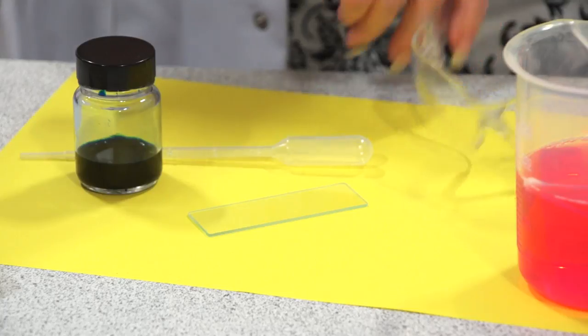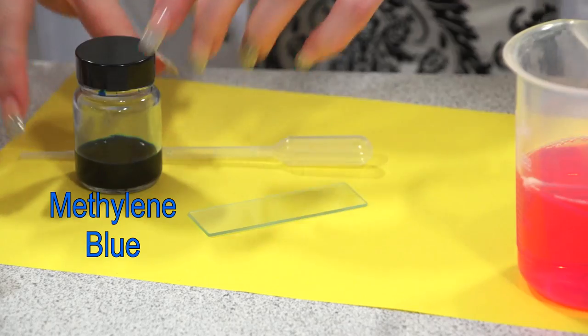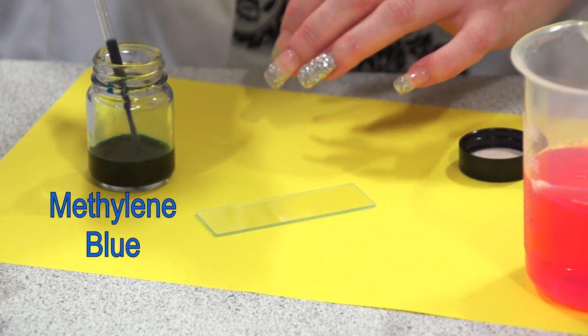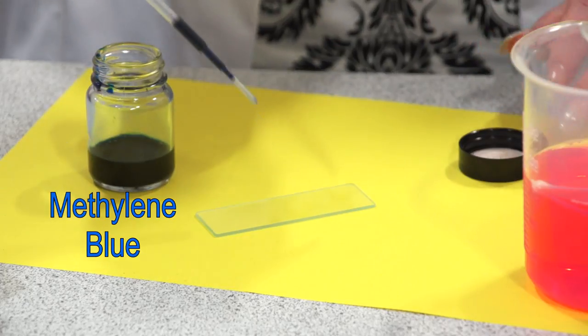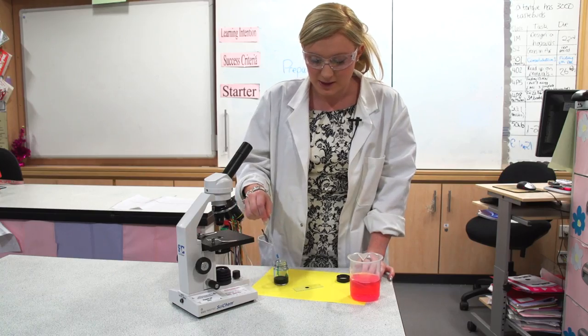For the next step you'll need to put on your safety goggles. Collect some methylene blue dye — this is a special stain used to make cell structures more visible. Place one drop onto the centre of your slide where your animal cells are.